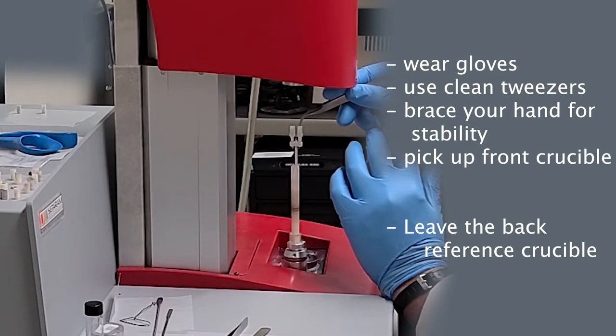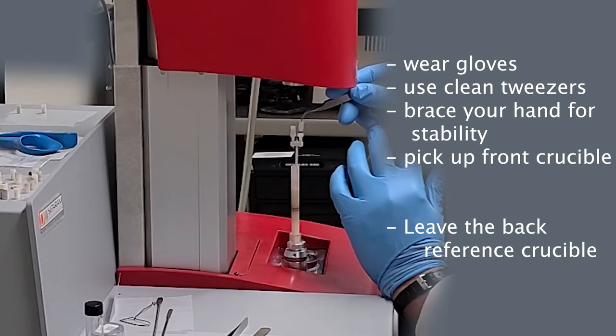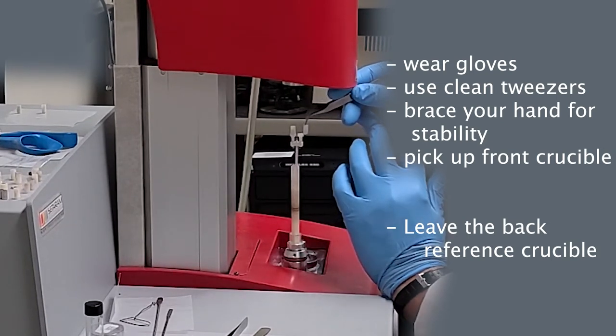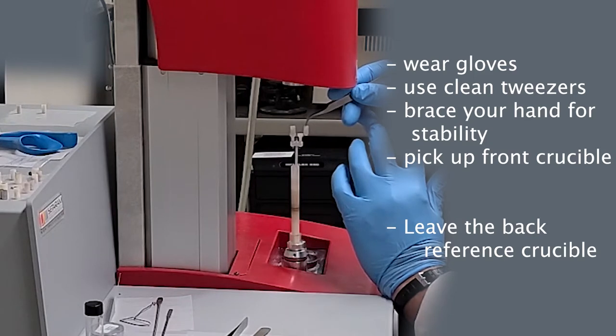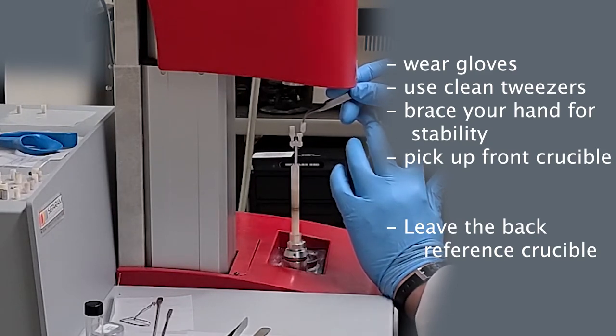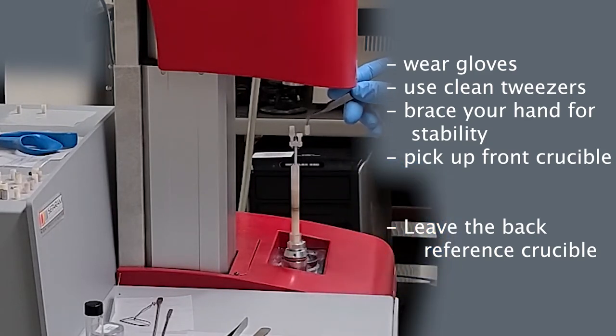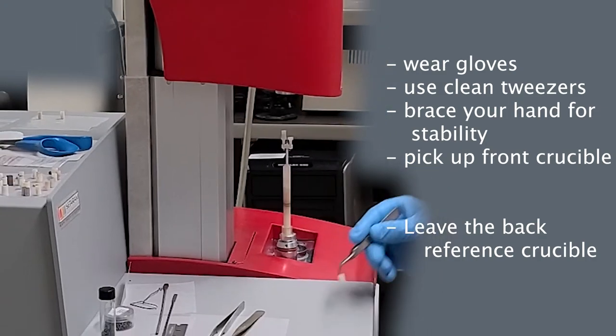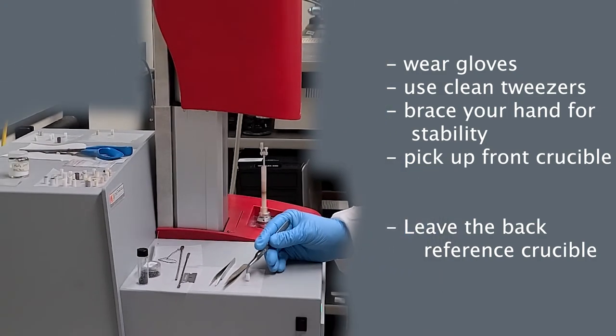Brace your hand for added stability and remove the sample crucible by pinching the top of the crucible wall with the tweezers. The back crucible contains the alumina reference material; please leave it in place.